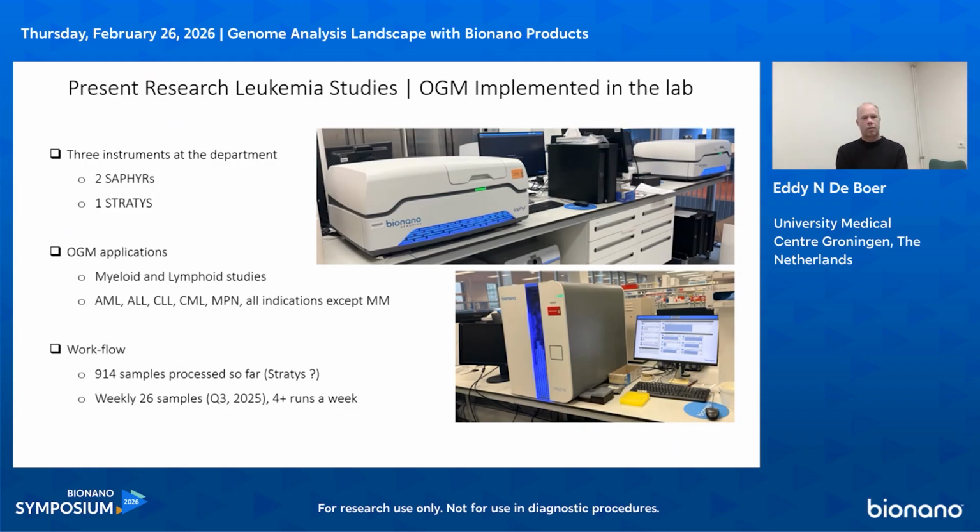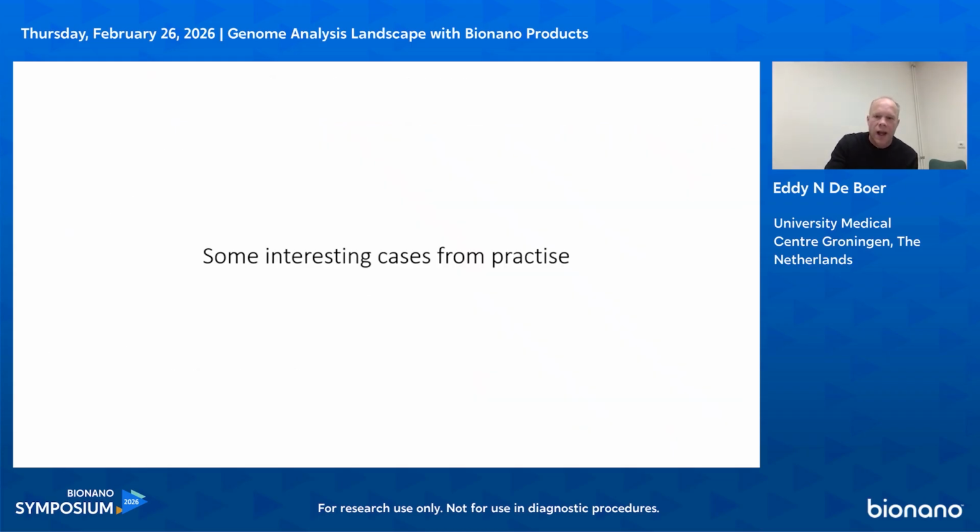We processed about 900 samples until now, and weekly we process about 26 samples, and that is 4 runs a week. And now Arjan will show you some interesting cases from practice.